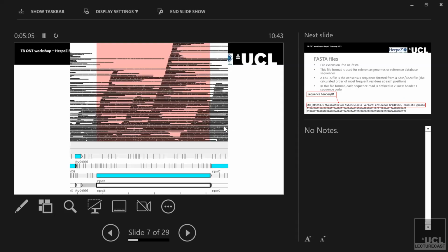Yeah, so that's exactly what I was saying. So down here, this is kind of the equivalent of the reference genome. And if I had zoomed out a bit, you'll see what the actual sequence is for H37Rv. So it might be A, T, G, G, G, G, G, whatever. These are our reads that have been aligned by Minimap. And it knows that this read goes here because it aligns with this, and then this read goes next door to it. And they've all been given a number so that the computer then knows this read clearly goes there. So that's basically what that is.